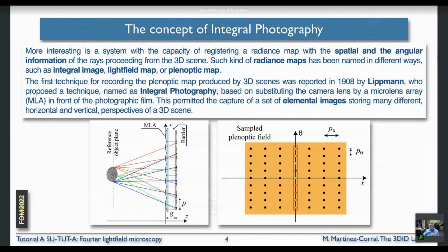And what we see is that this camera is collecting a series of 2-dimensional images, each with a different perspective, but conical perspective. What does conical mean? It means that closer objects provide bigger images, and when they go further, the images are getting smaller. So this is conical perspective.